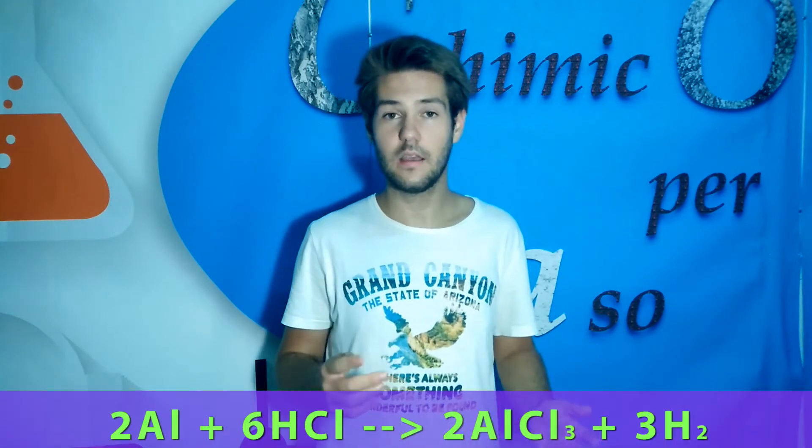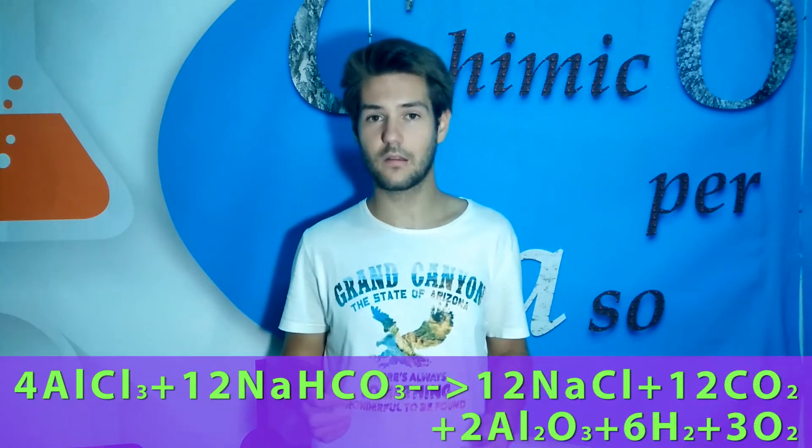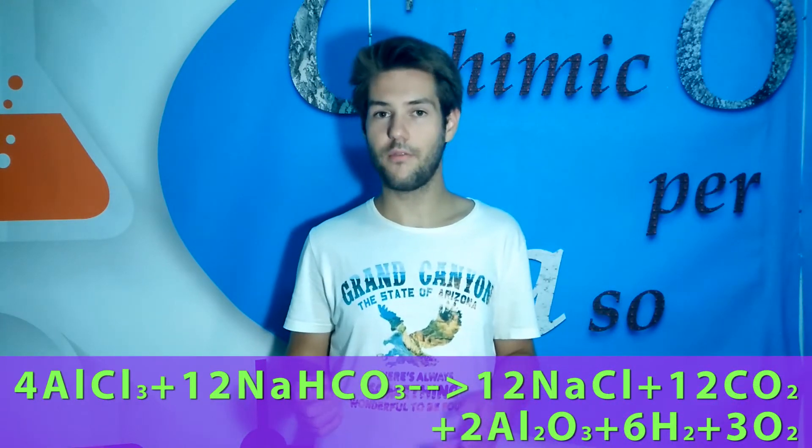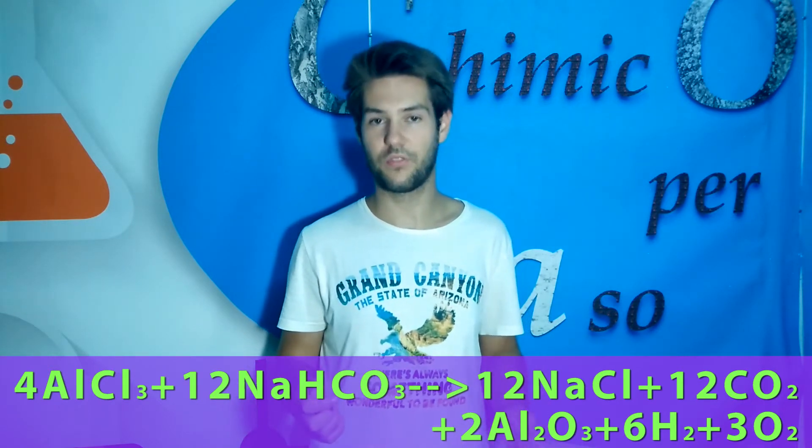What we see here is the reaction between hydrochloric acid and aluminium. In this reaction, aluminium chloride is formed and also some hydrogen. We need aluminium chloride because this will react later with the sodium bicarbonate. Reacting with it, it will form aluminium oxide, which is actually the salt that we want, and this salt is very insoluble in water, so it will be very easy to see if the reaction has worked and also to remove the salt from the solution.